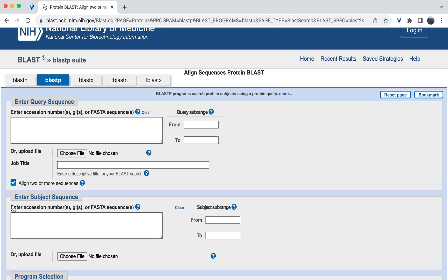In this tutorial, we will compare one protein sequence with a reference sequence for that protein in order to determine if there is variation in the protein sequence. A reference sequence is considered a standard sequence, or in this case, a sequence without variation.